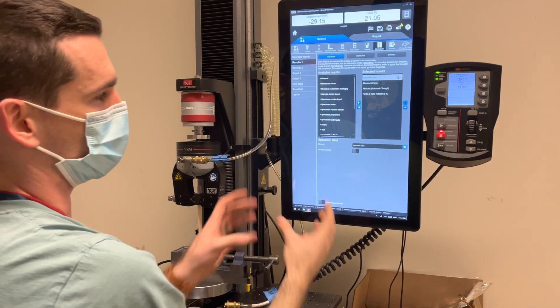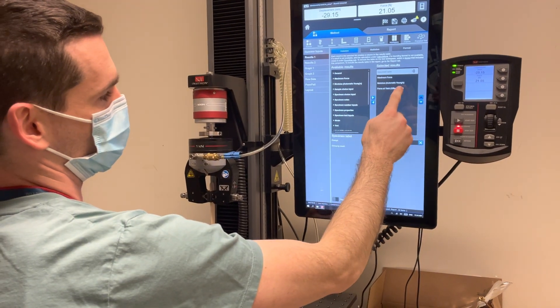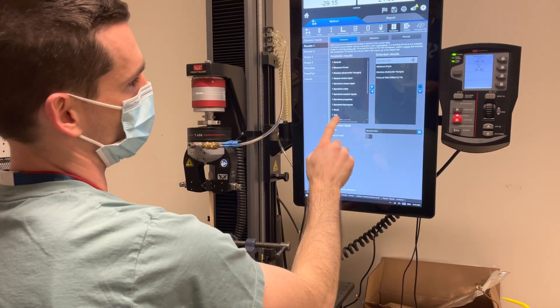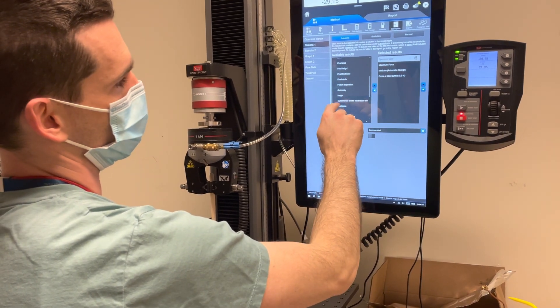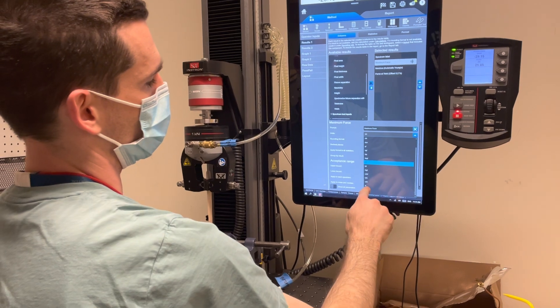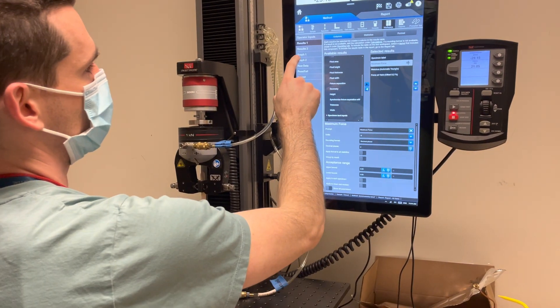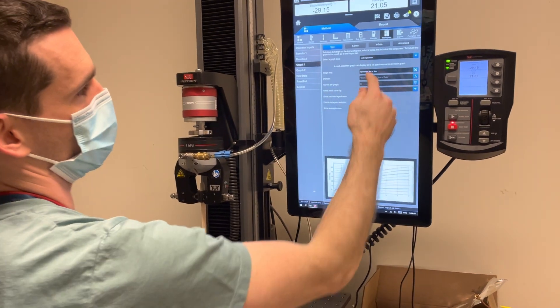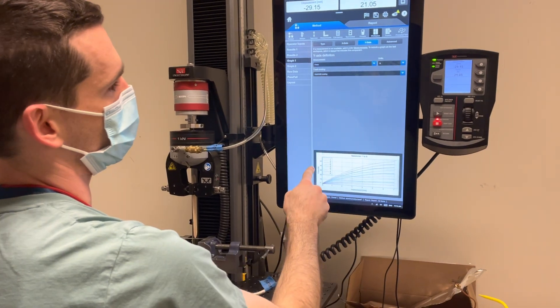In results, that's going to be a data table — probably one of the more important things. First, specimen label is the most important: under specimen properties, find specimen label in that list and move it over. For force, always put force into newtons instead of kilonewtons. In the graph, same thing — in the raw data, change kilonewtons to newtons so that it scales appropriately.